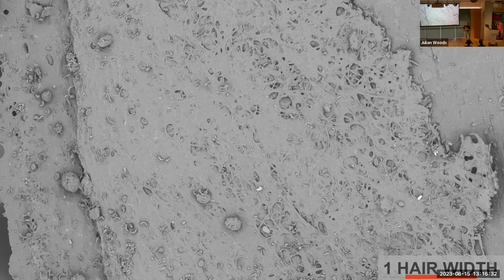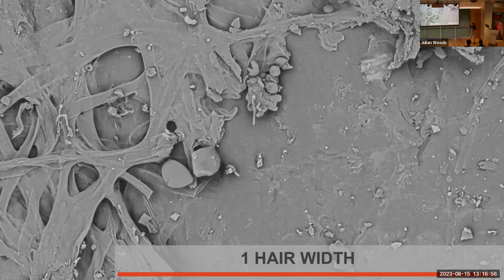Actually, in some indigenous cultures, indigenous tribes in Australia, they've used some spinifex grass and ground it up, and you can see those fibers that are used in adhesives under SEM. And so we can inform ourselves maybe what some historical uses of adhesives were, or how the adhesives were made, and we can learn more about those. So we can get really up close and have a look at the dust and other things on the surface that might inform us about certain artifacts.